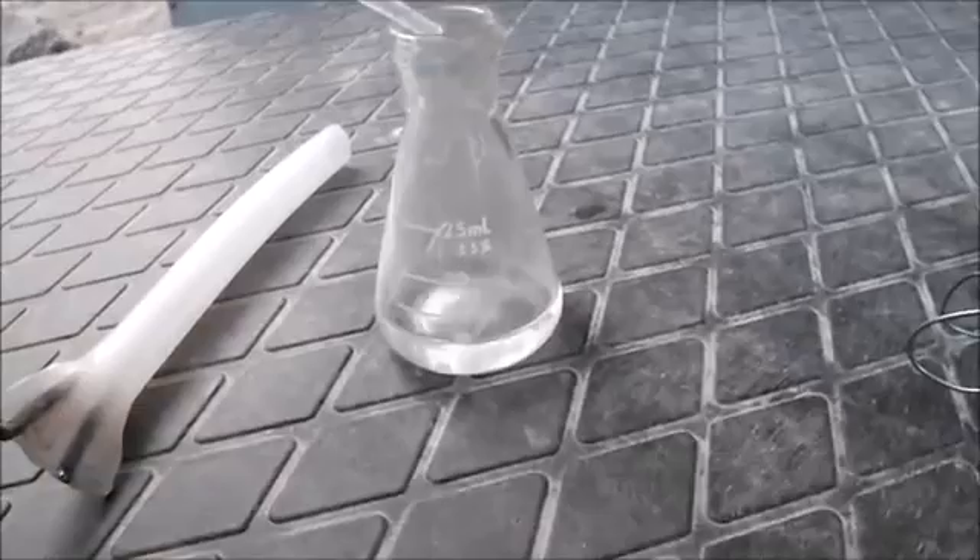Hi everyone, Cody here. Welcome to the hopefully final episode of my making heavy water endeavor. I've got here the water which we had confirmed is slightly heavier than normal. I'm going to go ahead and drop in a little bit of sulfuric acid because it needs to be electrolytically conductive again.